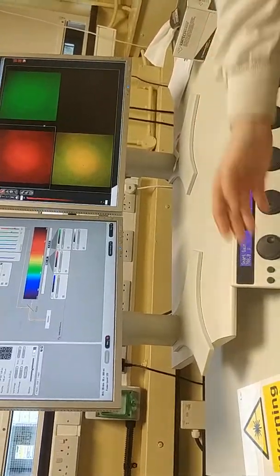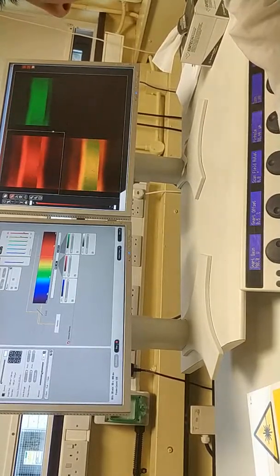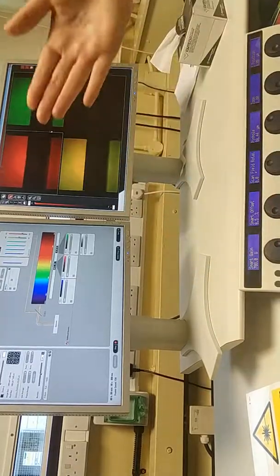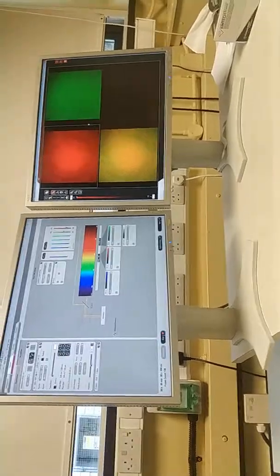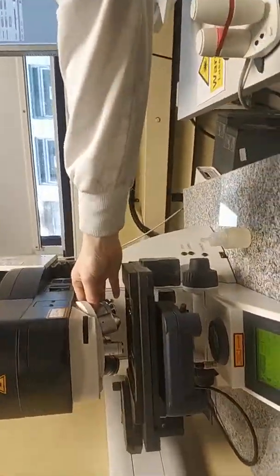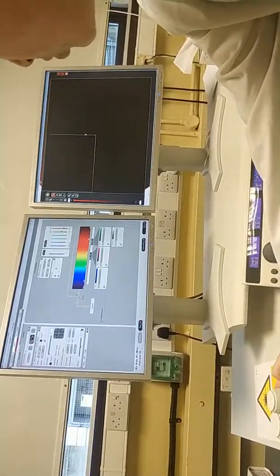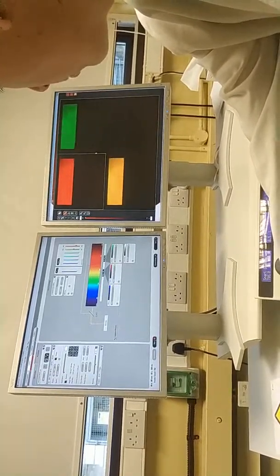So okay, now if we go up and down, we can't really see much. We see that there is some fluorescence, but the thing is that we are at 5x magnification. We are only magnifying 5 times, and your droplets are probably very small. So now what we can do is to increase the magnification. So we go to the next one, 10x. And usually you have to adjust again a little bit the focus, but it should be close now. You shouldn't be very far from the real focus.